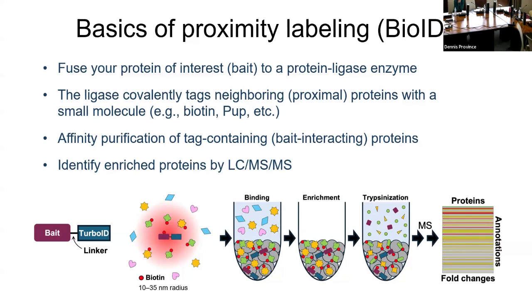So the binding reaction takes place. The beads bind to the red biotin. Those get pulled down. The stuff that wasn't biotinylated, you wash out, at least hopefully. And you end up with these beads. And then this is actually what we send to Arkansas. And then they carry out trypsinization and a bunch of LCMS steps.